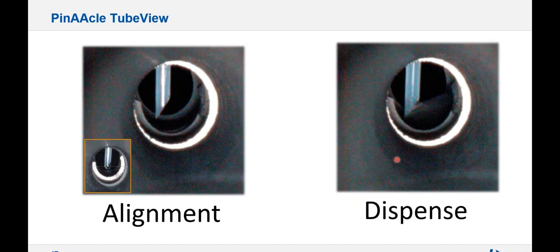What's important is the height of the capillary needs to be such that the last droplet that gets dispensed will touch what is already in the tube and get pulled off, because you don't want that last droplet clinging to the sampling capillary, because then it will end up on the dosing hole. You also want to make sure that your sampling capillary is not too low, because you don't want it submerged in the solution that's already in the tube as well.